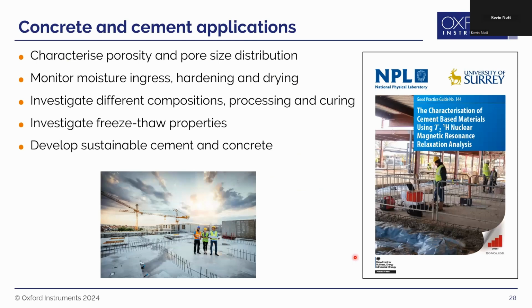In addition to investigating different compositions and hardening, TDNMR can also be used to measure porosity and pore size distribution, as well as investigate freeze-thaw properties. Ultimately, TDNMR is a useful tool which can be used to develop sustainable cement and concrete, enabling the industry to meet its net zero targets.